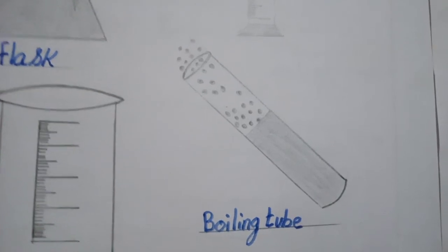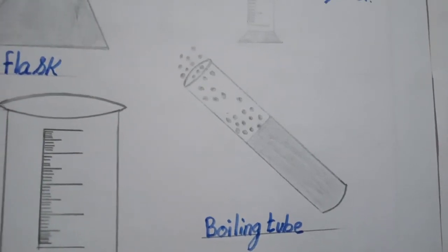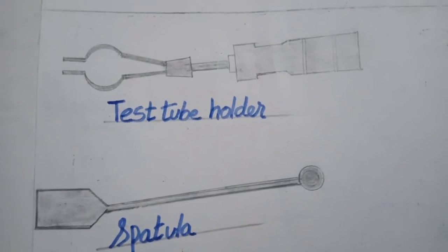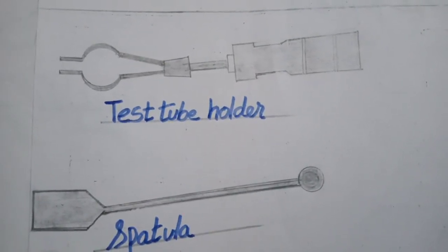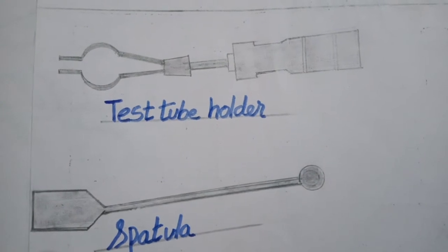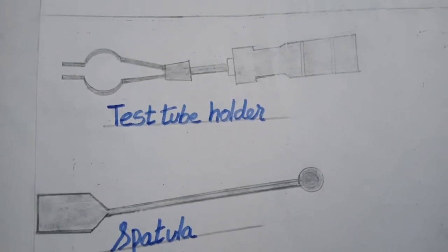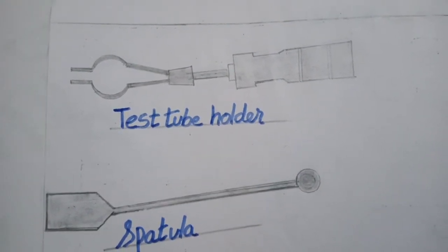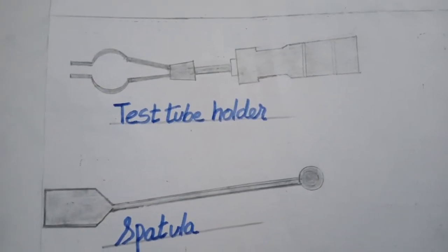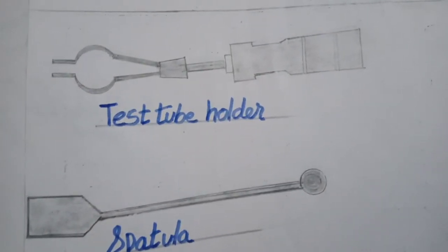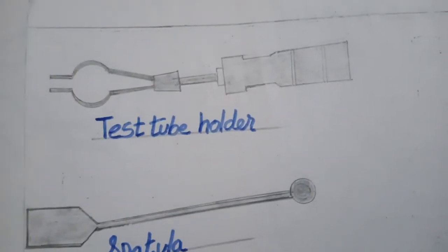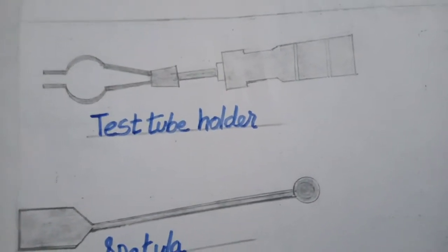Next is a test tube holder. This test tube holder is used when you are working with salt and mixtures in the test tube. Chemicals can be very dangerous, so you use this to gently hold the test tube while applying chemicals.